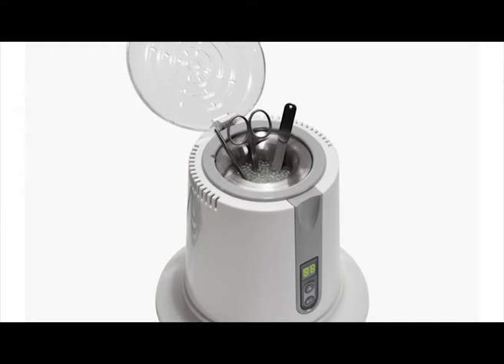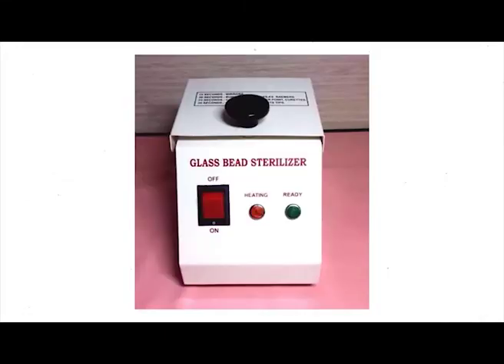The instrument tips become extremely hot and must be cooled before use. One set of surgical instruments may be used on up to 5 rodents during the same surgical session if the instrument tips are sterilized between each animal using a glass bead sterilizer. Only under special circumstances may glass bead sterilization be used as the sole method of sterilization.